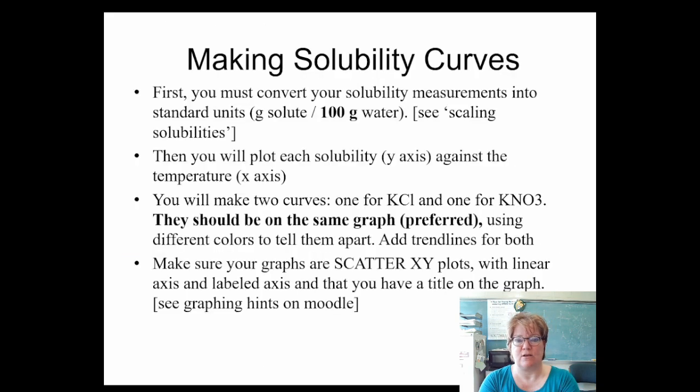When we're done, you're going to make a solubility curve. We'll talk about this, I'll make another video for analysis. But basically, first I have to take all my data and convert it to standard solubility. And then I have multiple temperatures. I have the individual 3 temperatures, and then I'm going to average them, and I'll have an average. So I kind of have like 4 points for each mixture. But I want to consider the average to be a separate curve from the individual temperatures.